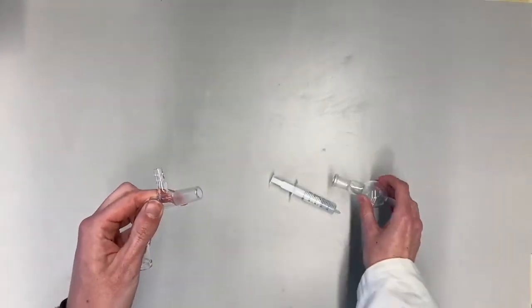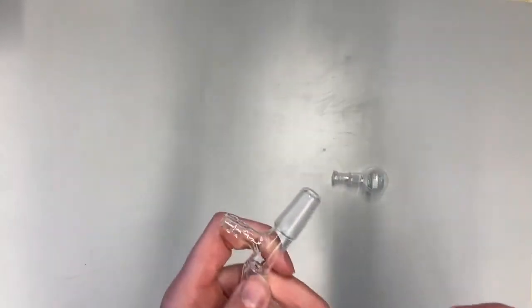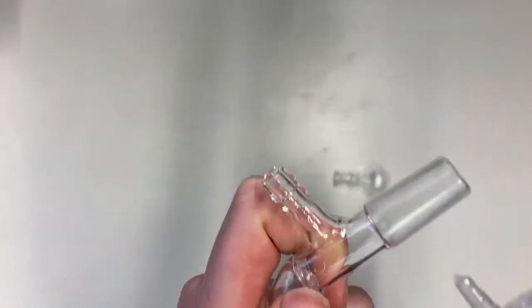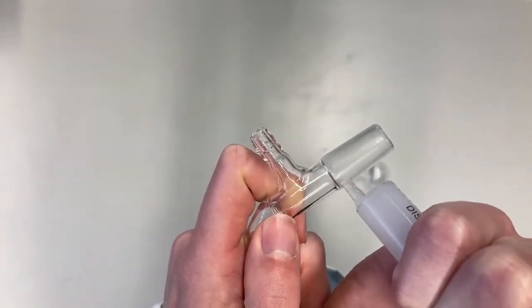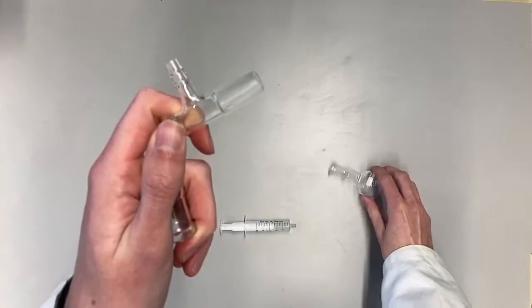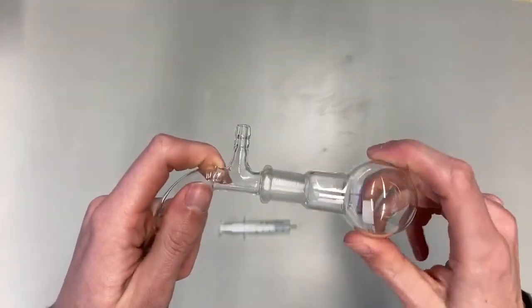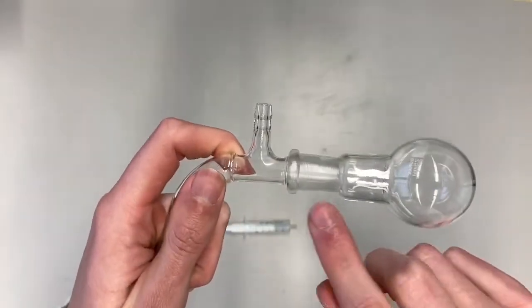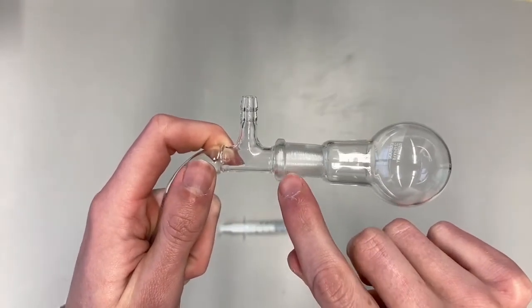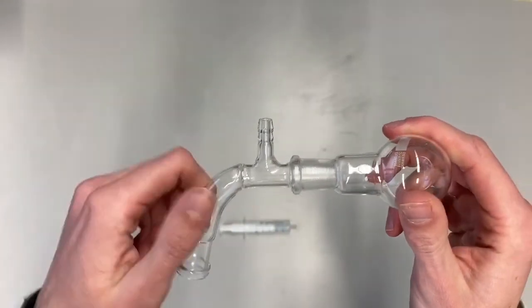So to prevent this from happening we will add a tiny bit of grease. You can add a tiny bit of grease at the top part of the male connector, place the female joint over it and rotate it. And you should see a slight change in opacity around this area of your joint. This is how you properly grease a joint.